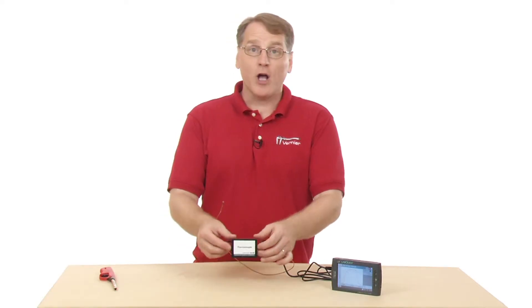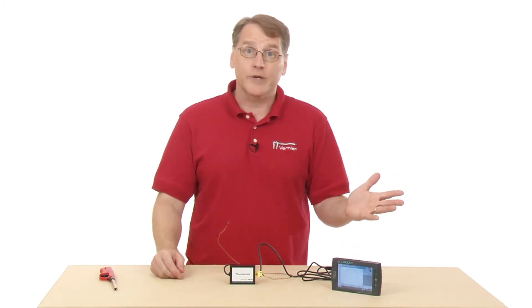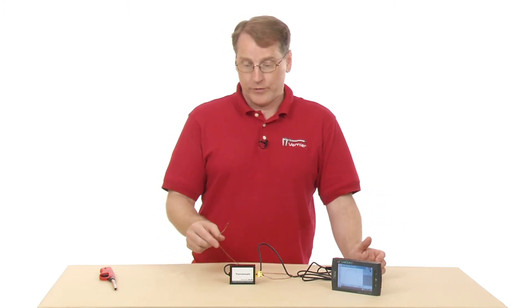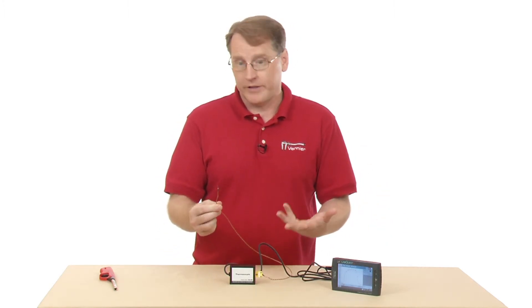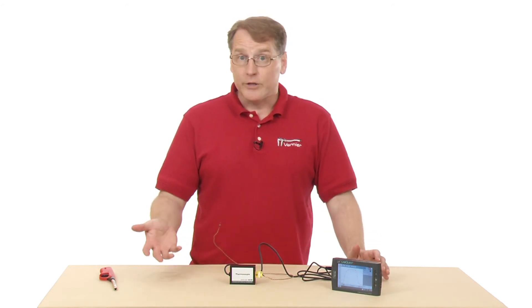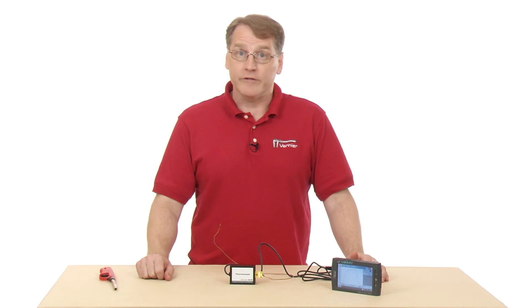The Vernier Thermocouple is used for really wide ranges of temperature measurement — down to 200 below zero Celsius, up to 1400 degrees. So down to liquid nitrogen, or if you wanted to place this into a flame or an oven, this would be the sensor you would use for that. For other uses, you might take a look at the Vernier website.